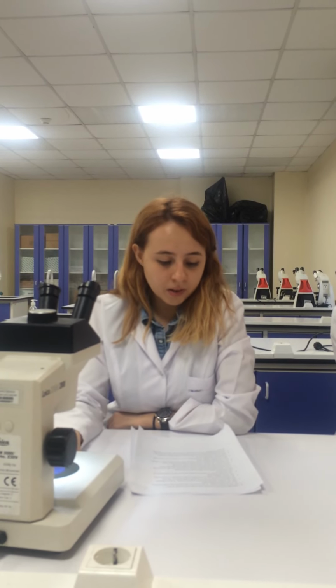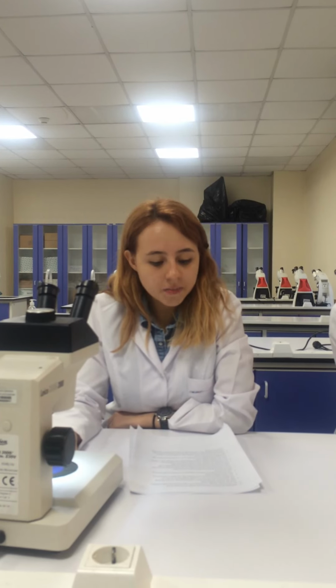The 10% formalin solution is removed from each well and the plate is washed twice with double distilled water. After 2 washes, 2% alizarin red S solution is added to each well and left for at least 15 minutes on a gentle rocker shaker at 100 RPM. The alizarin red S solution is removed and then the plate is washed twice with double distilled water. 10% formalin solution is added back. Osteocytes are ready for observation by light microscopy.